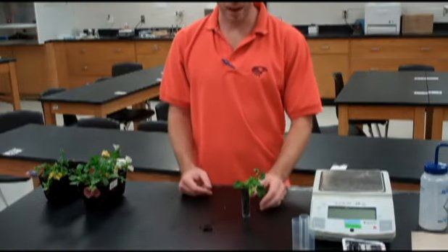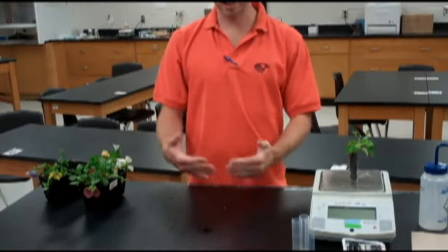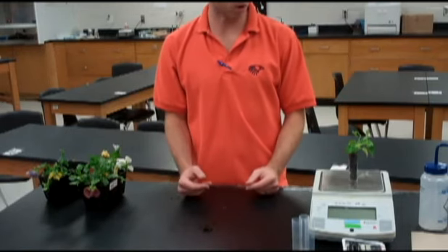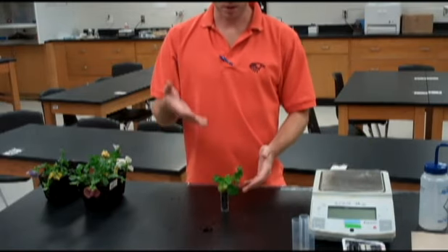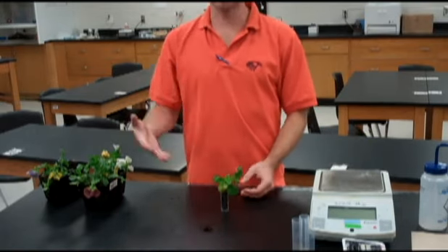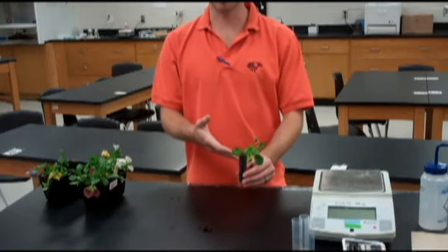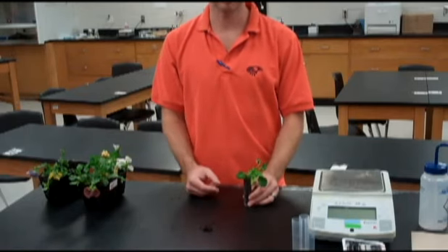After a couple of days, come back. We're going to mass it again and find our percent change in mass. That change in mass should be only the water lost over about that 48-hour period. This is the basic setup. You'll want to run a control plant, and you can also test any number of conditions to compare to your control and see the effect of different conditions on a plant's water loss over time. Good luck.